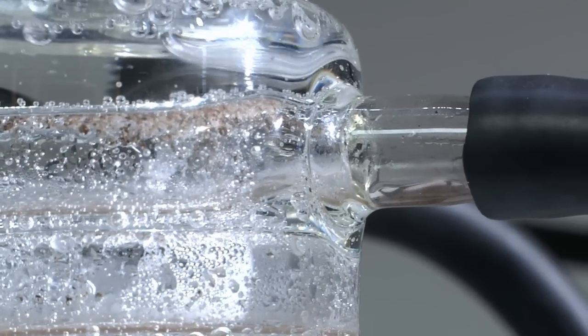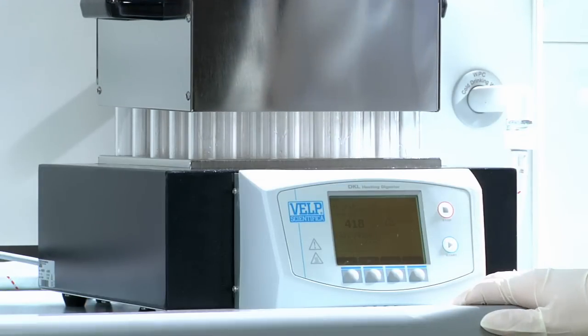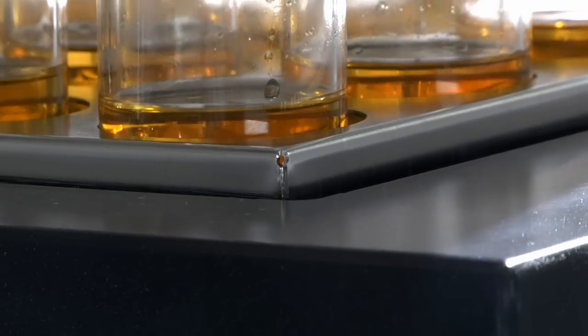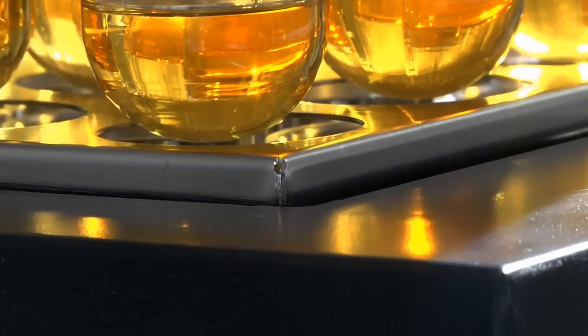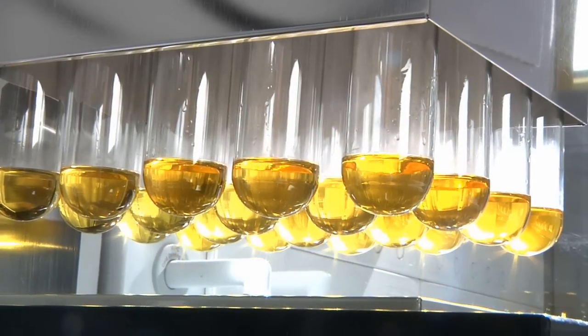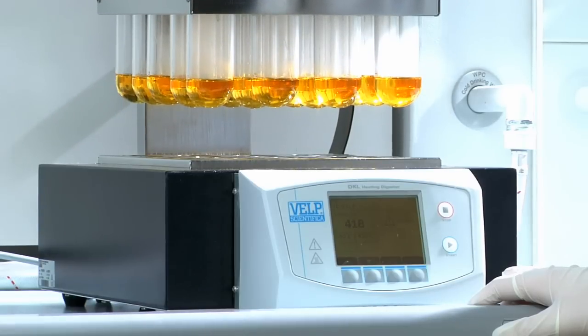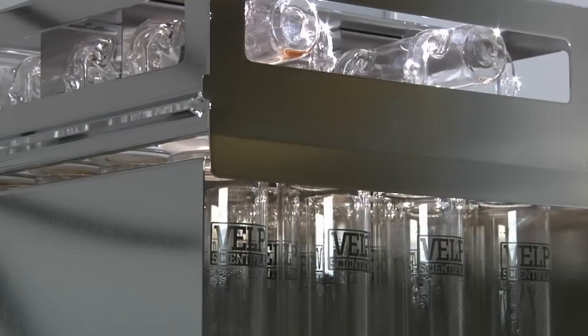At the end of the analysis, the rack is automatically lifted and remains in contact with the suction cap manifold for continuous extraction during cooling. Once the operator is ready to proceed, he can automatically separate the rack from the suction cap.